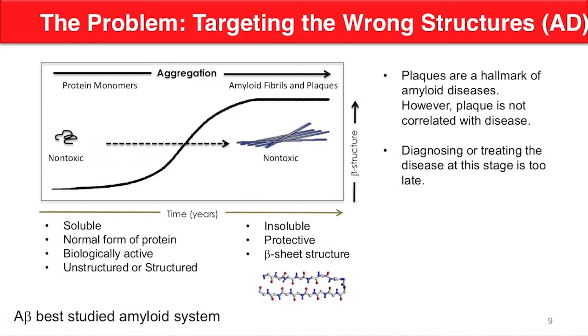We can see a change in fluorescence when the dye THT, thioflavin T, is bound by the beta sheet structure in the fibrils, and we see a rapid increase and then another plateau after mature fibrils are made. So remember, this is a change in structure.